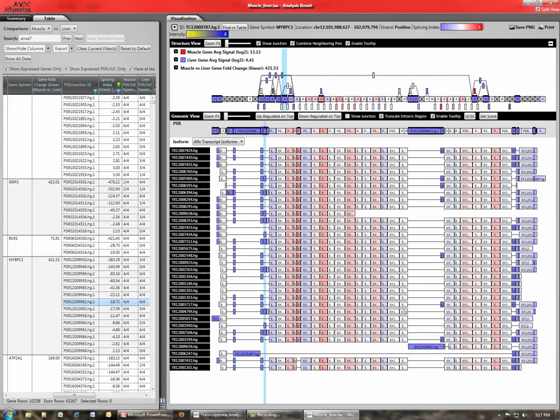So now if we turn our attention to what are the pool of transcripts that would be expressed in the muscle tissue. One way to think about it is you could potentially naively go in and assume that anything that is blue wouldn't be expressed in muscle. That's not quite true, and I can show you exactly why this won't happen, again, using sort of the same thought experiment, right? So if you try and avoid any blue in the transcripts, you can see all of these guys aren't going to be selected.